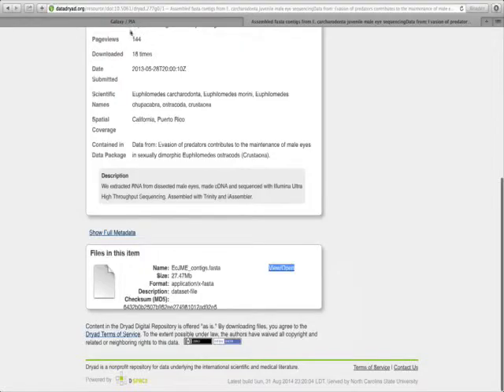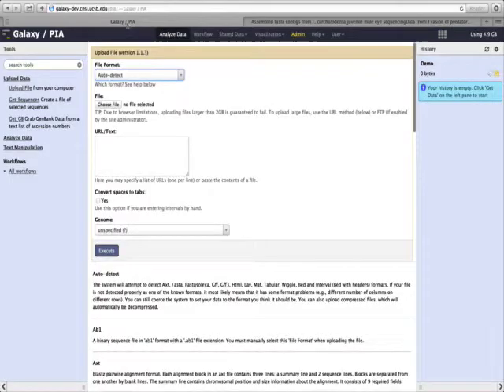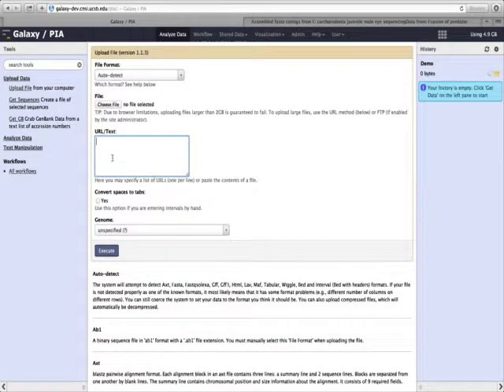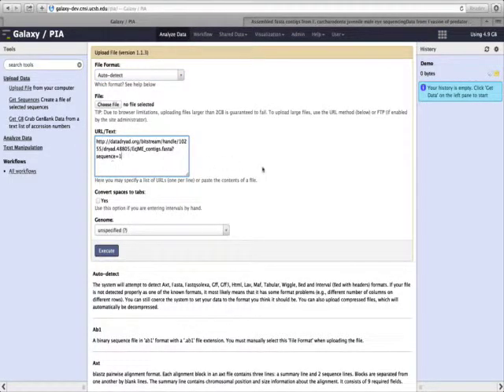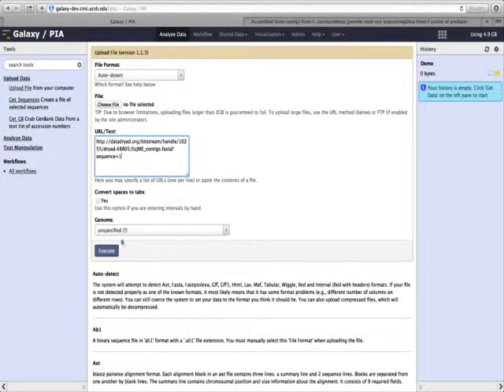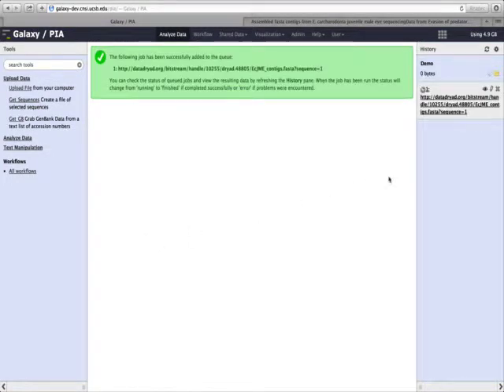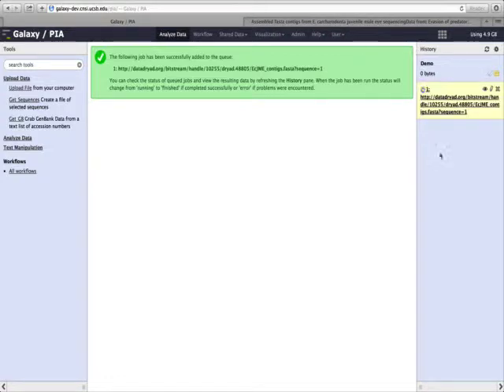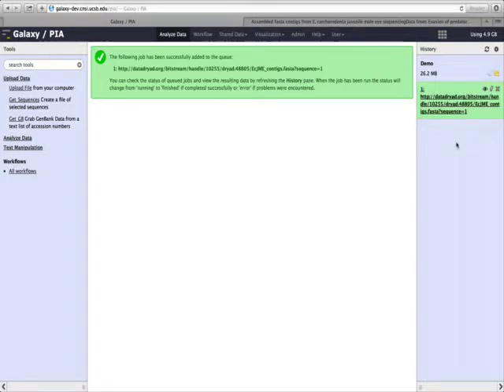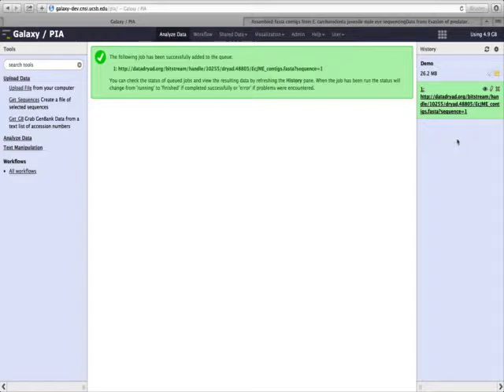Then I'll go back to the PIA website and paste that link into the box asking for the URL. I will click on Execute, and that will start the download of the data from the website. When a tool here in your history is gray, it means it's waiting to run, then it turns yellow while it's running, and now green, signifying that the tool is done running.